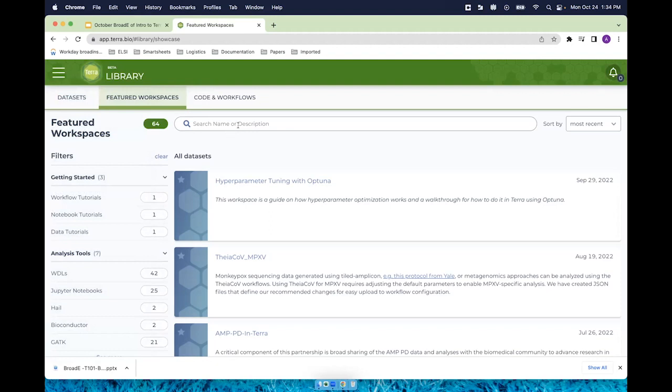I'm just going to give everyone a moment to find their way over here. I'm assuming everyone has found their way over to the featured workspaces list.